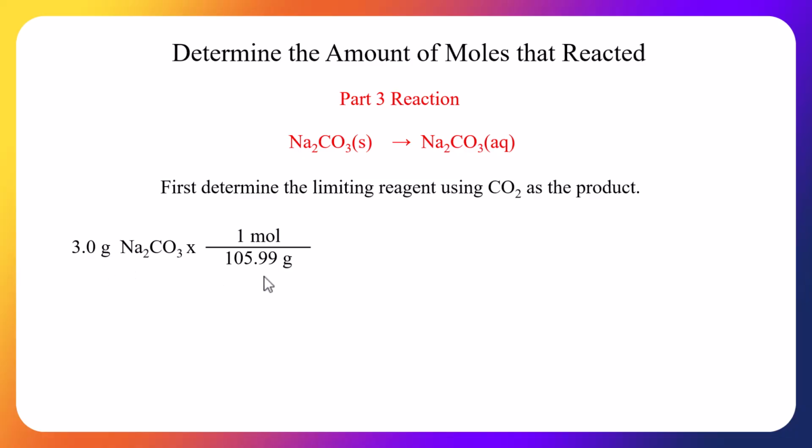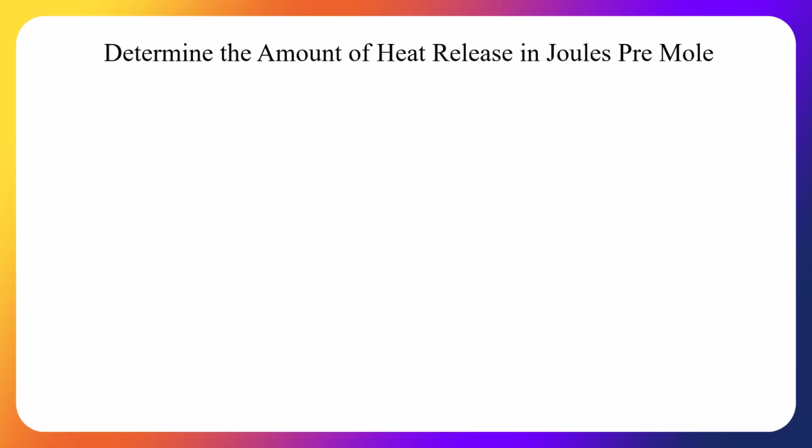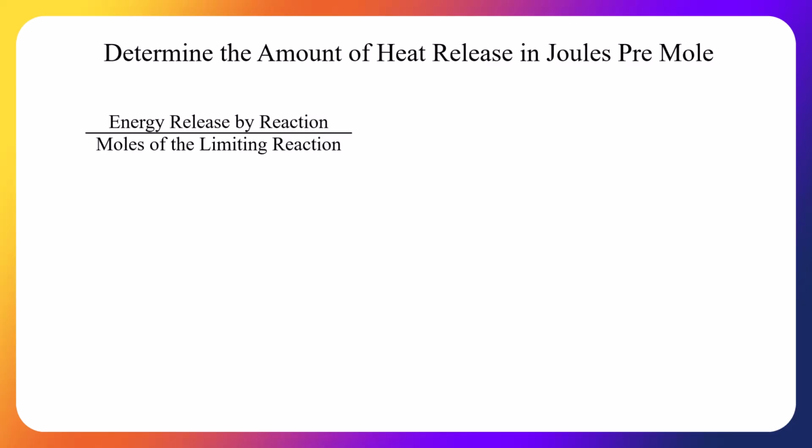I'm going to divide it by its molar mass. This is going to be in moles of sodium carbonate. That is the limiting reagent. It's the only reagent used. Grams cancel, and you're at moles of sodium carbonate. Now, determine the amount of heat released in joules per mole.